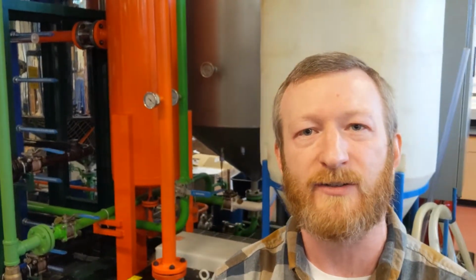This is where we're going to do the final refining. We're going to use the world's most magical substance to do the final refining on our biodiesel. The world's most magical substance is water, right? Water has so many unique properties, and the one that we're really interested in is its dual polarity. It has a positive charge and a negative charge on the same molecule. It's got dual polarity, brah.